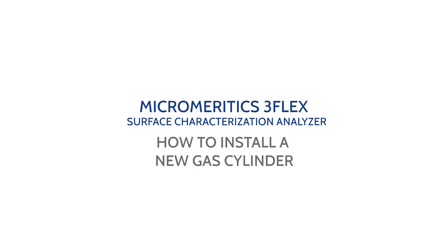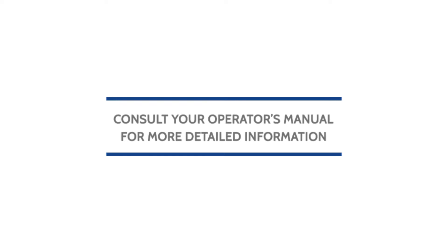This video will guide you on how to install a new gas cylinder and perform a diagnostic test on the Micromeritics 3Flex Surface Characterization Analyzer. Remember to always consult your operator's manual for more detailed information.